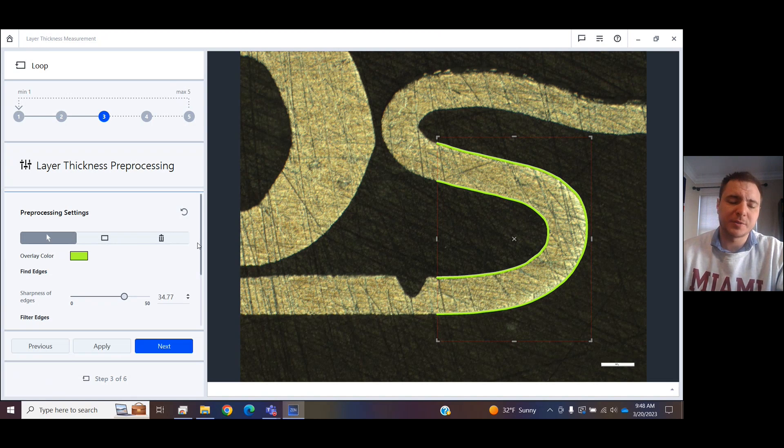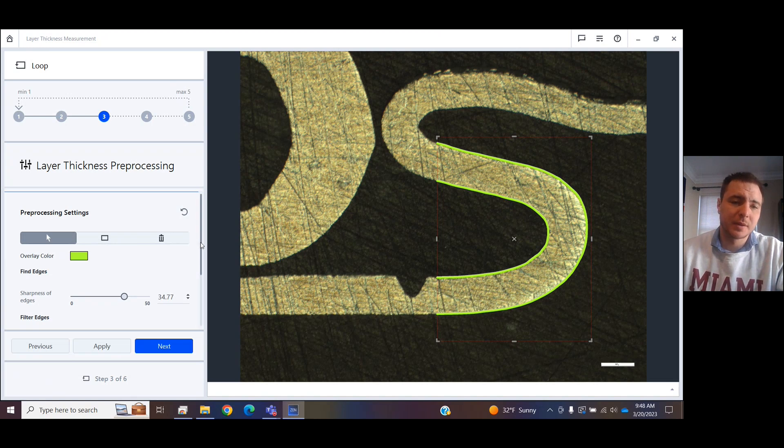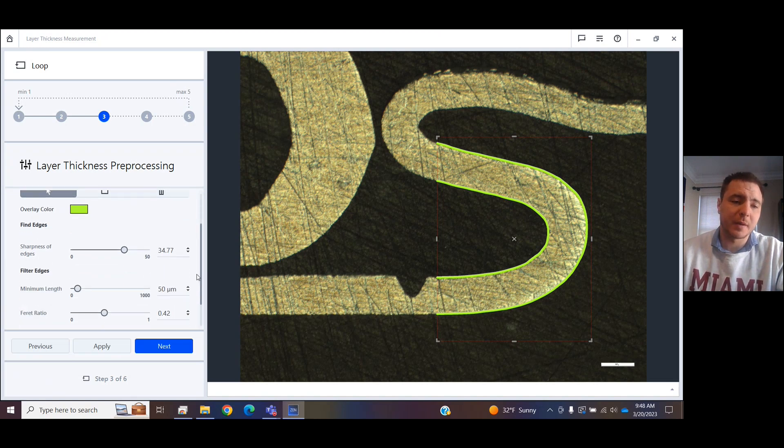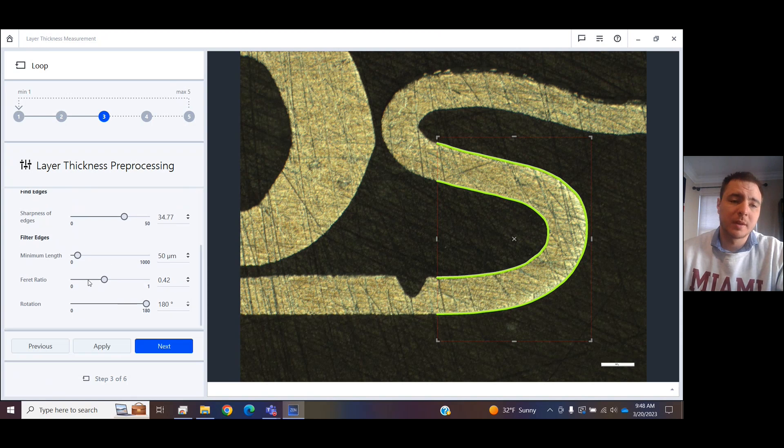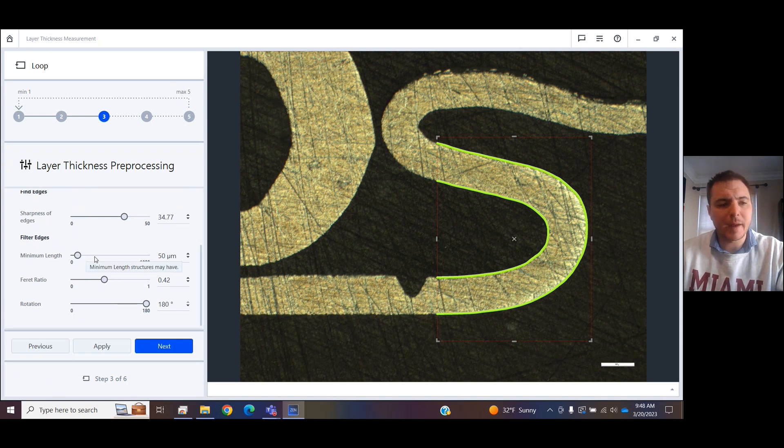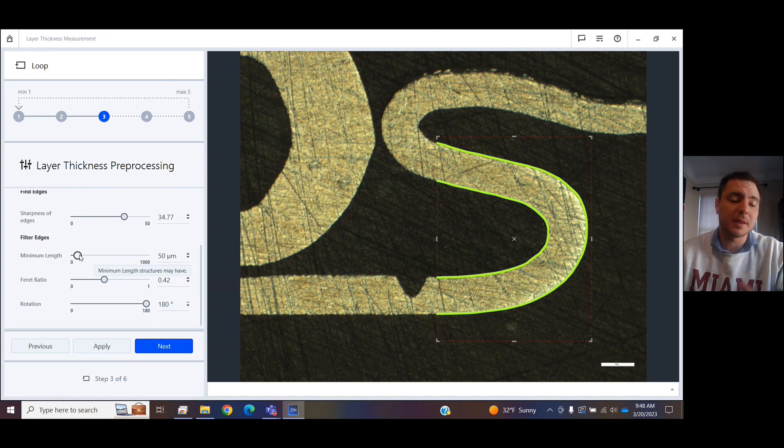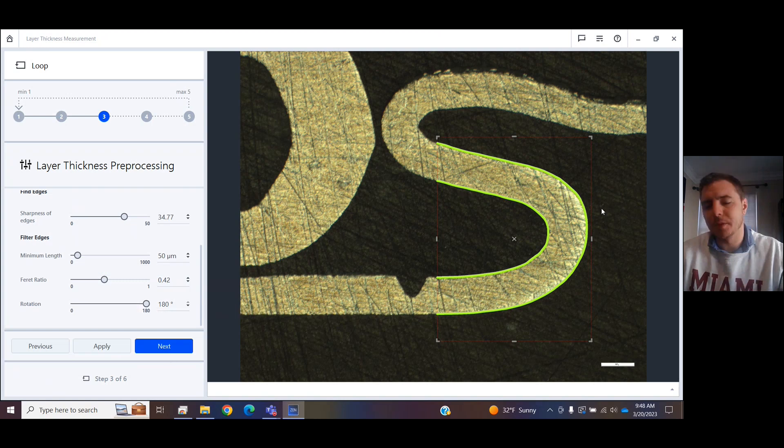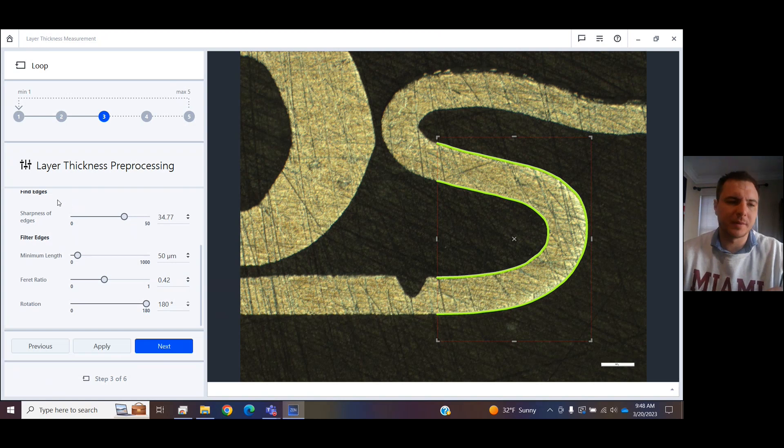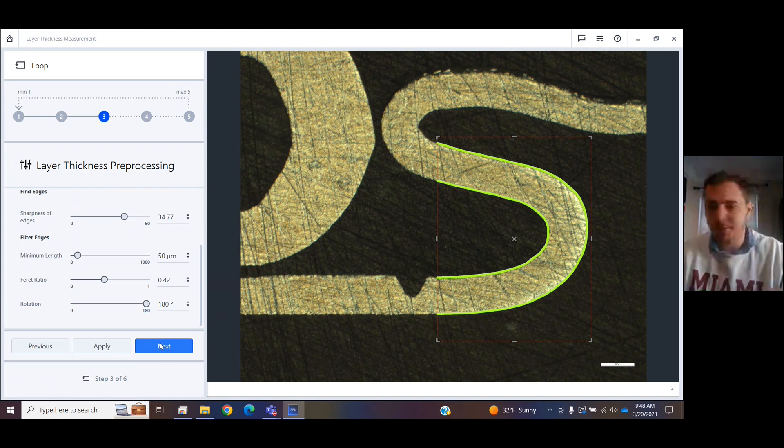You just got to tinker around with the Sharpness of Edges slider. That one's important. These all in here, I have found, do not matter as much. But you can change the Feret ratio, the minimum length of the edge of the layer or the rotation of the layer. These three don't matter as much as the Find Edges tool does. Once we're happy with the layers it's found, click Next.